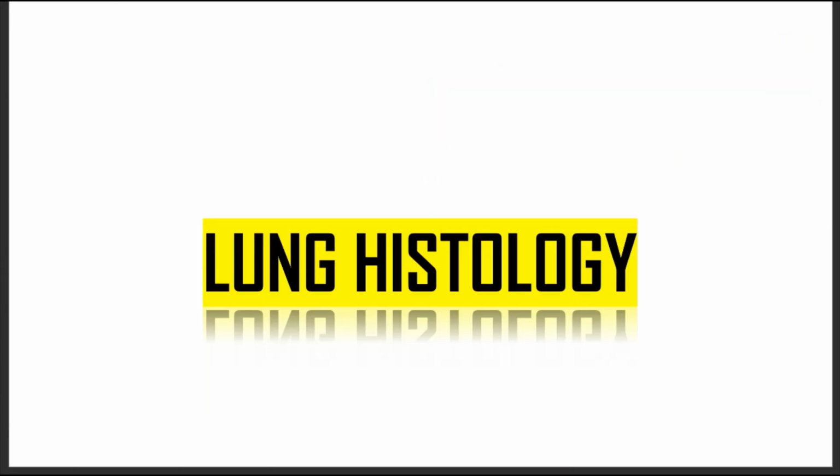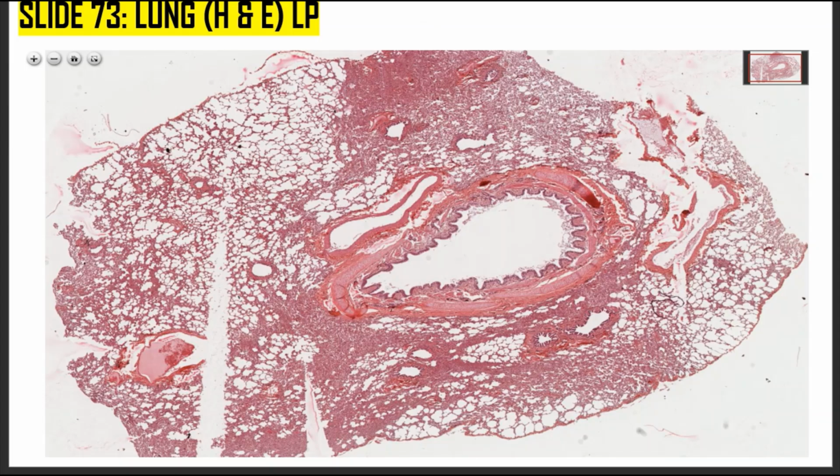Right, now let's look at the histology of the lung. This is the last histology that we are looking at. Under the lung, you're going to look at this basic picture, an entire picture. This is the lung at low power. You draw everything. This part here, this is the bronchus.